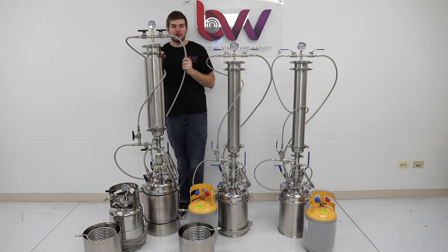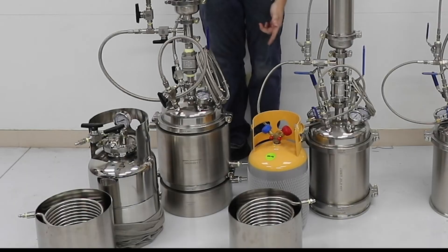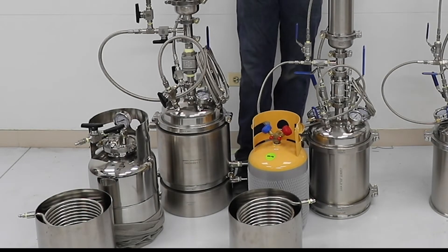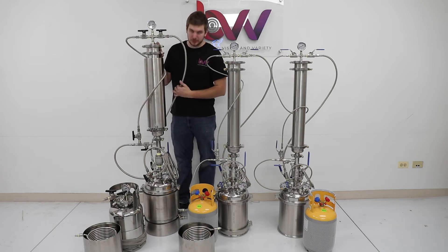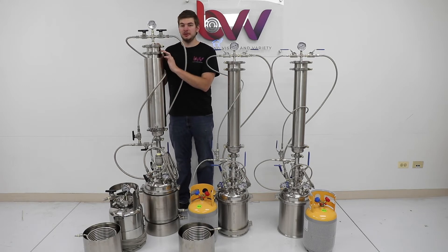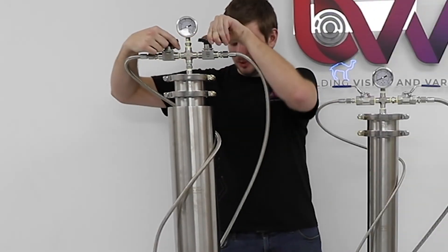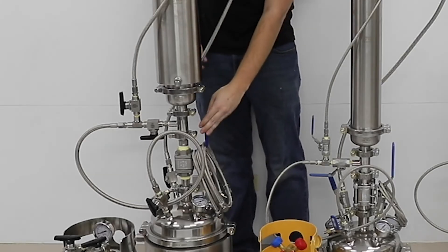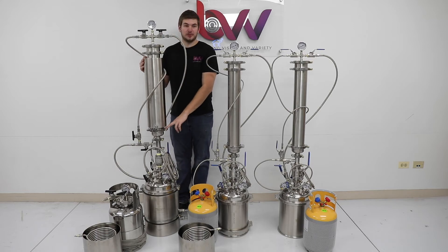Now we'll go to our Elite model over on the left. We have a couple of additional upgrades on top of the splatter platter. You'll notice our splatter platter is now jacketed, as well as the base. This allows you to run some external circulators with a heat exchange going on, so you don't have to lift your extractor in and out of water baths during the run. We have the SSP valves, or flow locks, and we have an AVCO low temperature ball valve that goes to our de-waxing column, which allows for a cold temperature extraction and eliminates fats and waxes.